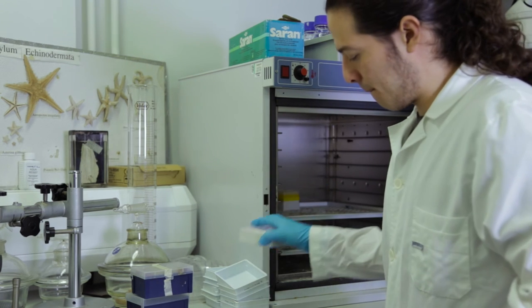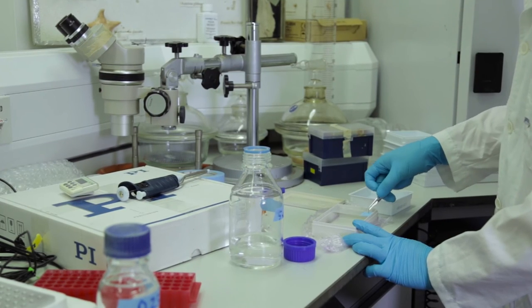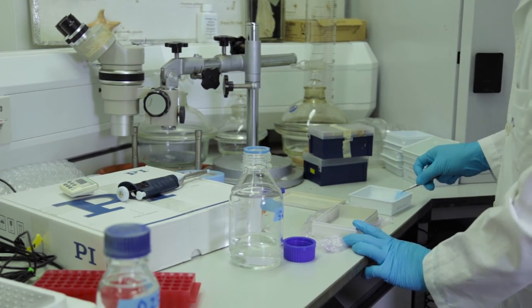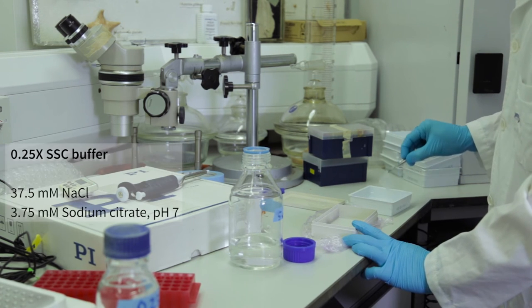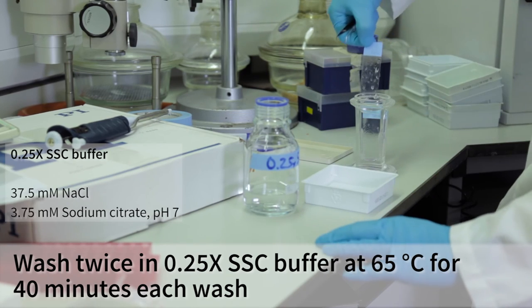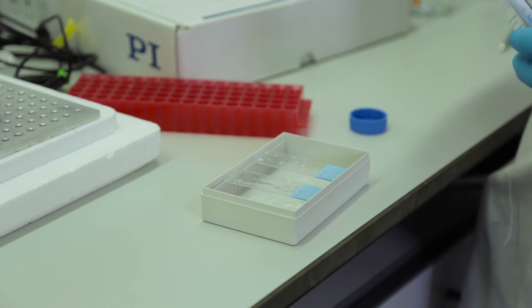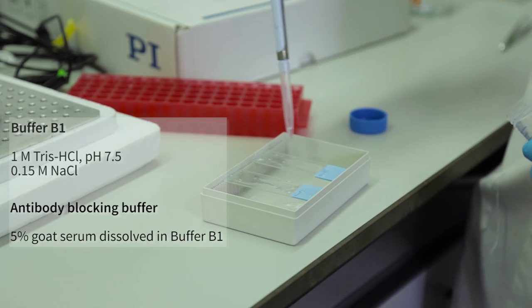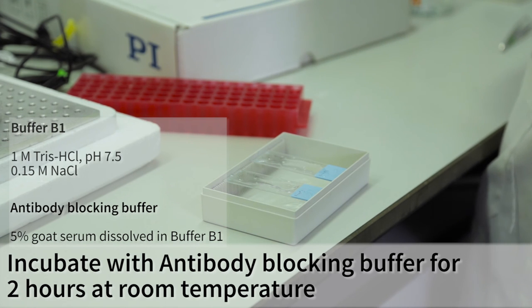Today, I will wash the slides to remove any non-specific binding of the probe. For this, I will remove the plastic tray from the oven and wash the slides in SSC buffer for 40 minutes twice. Next, I need to block any non-specific sites for the anti-digoxigenin antibodies, so I will add antibody blocking buffer and leave for 2 hours at room temperature.